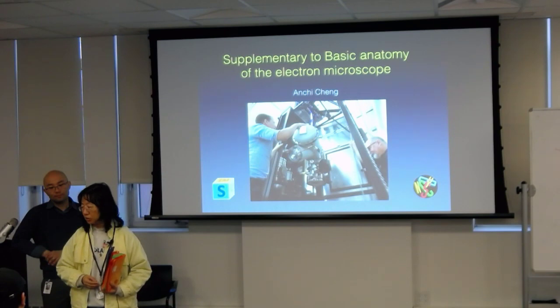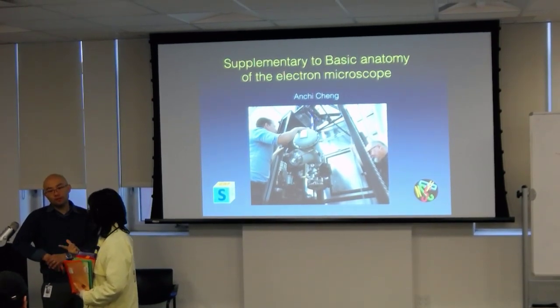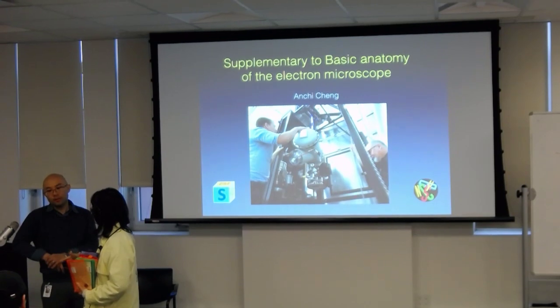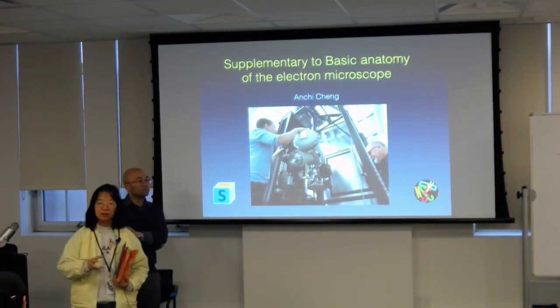And let me see, what else did I ask? I think it's high tension. I mentioned the detector and the camera, and then what else? Source. That's it. That's all I'm asking. Now, last question.